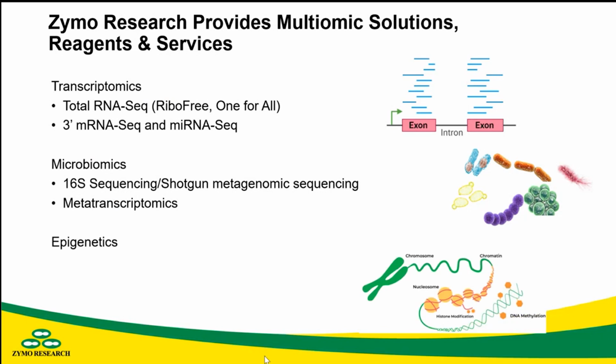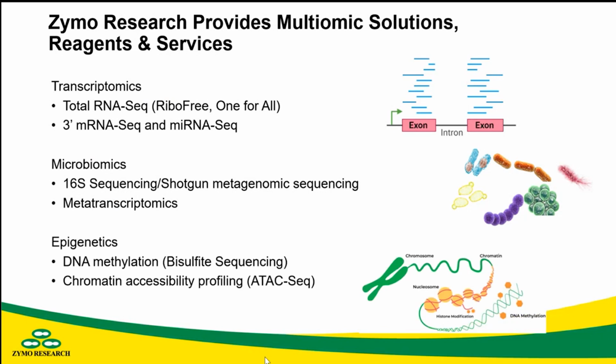And on the epigenetics side, we have well-known technologies to study DNA methylation and chromatin accessibility profiling.